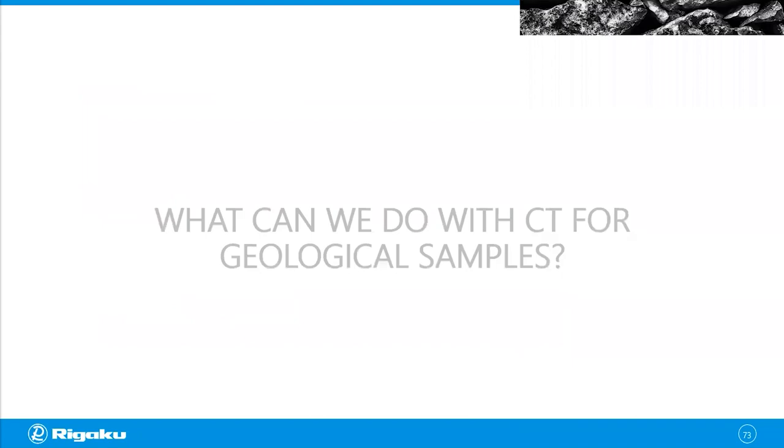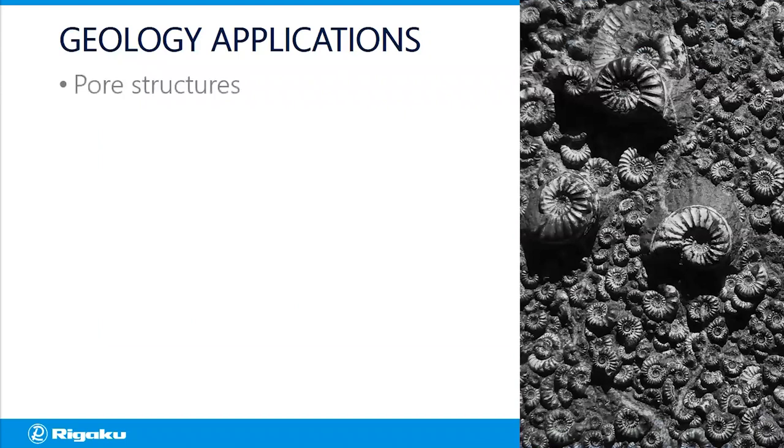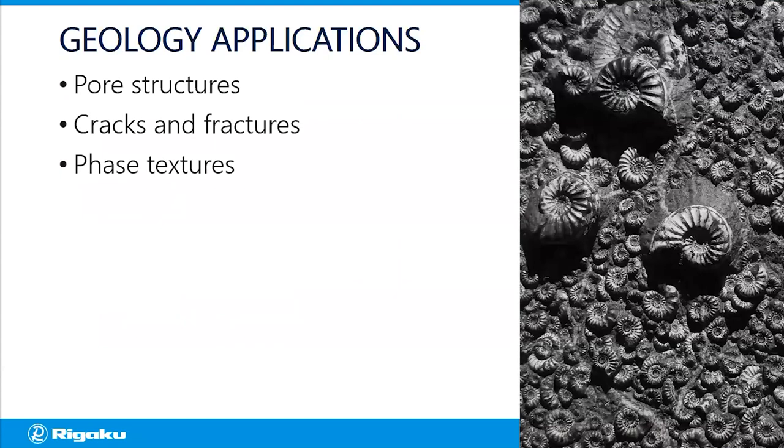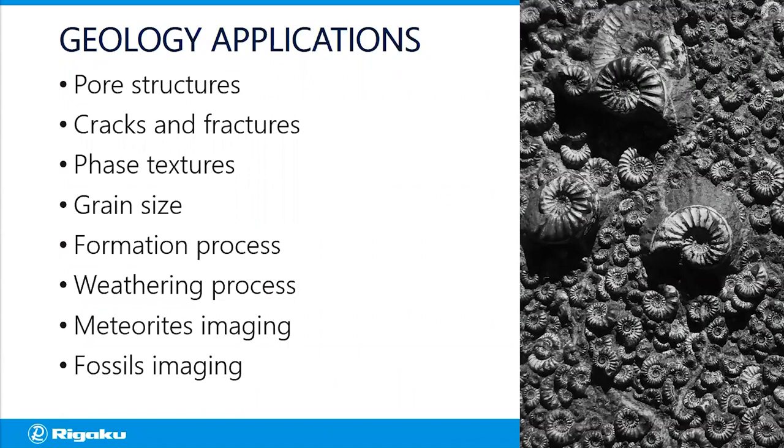So what can we do with CT for geological samples? There are many things we can do. For example, you can look at pore structures. You can look at cracks and fractures. You can do phase texture analysis, or you can quantify the phases. You can look at the grain size. You can also study formation process or weathering process. And the last two items are a little bit different, but if you have meteorites or fossils that are precious and you don't want to destroy them, then X-ray CT is a non-destructive imaging technique that can be very useful if you're trying to image meteorites or fossils.